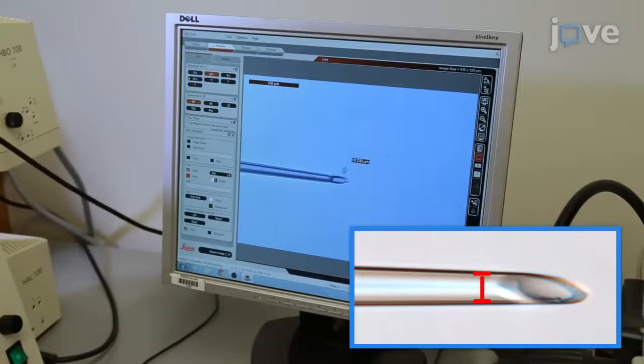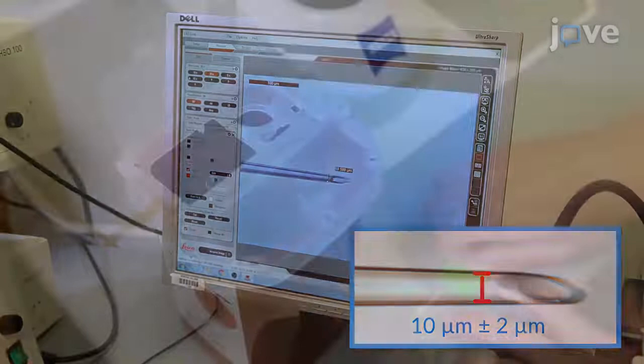Use the imaging software to measure the interior lumen diameter of the needle just proximal to the beveled opening. Discard any needles with an opening smaller than 8 micrometers or larger than 12 micrometers.